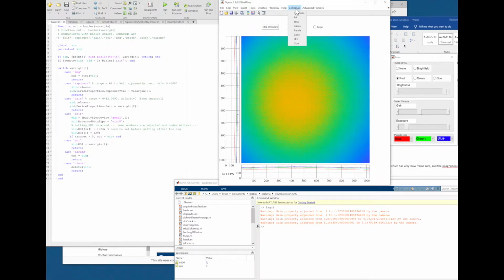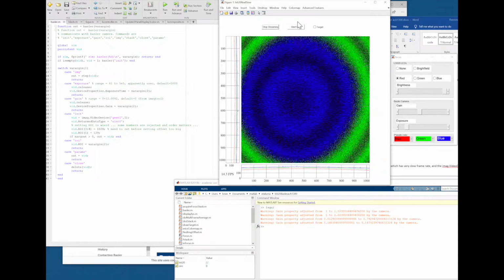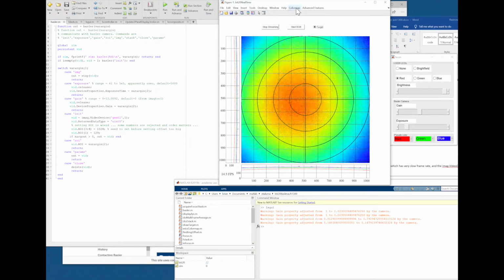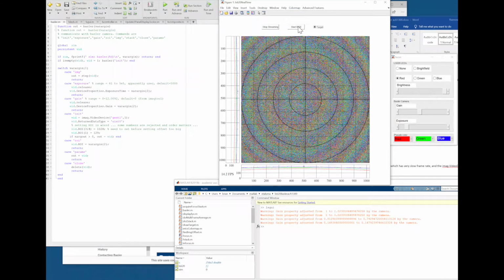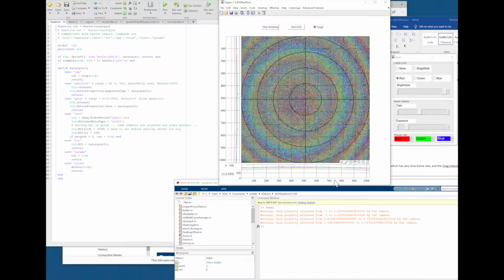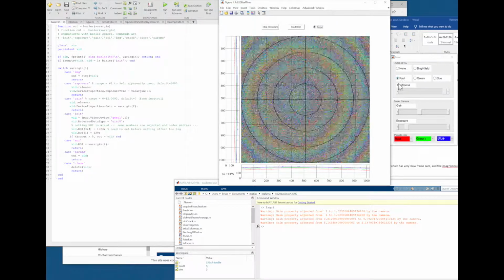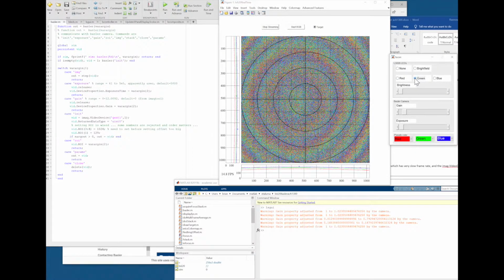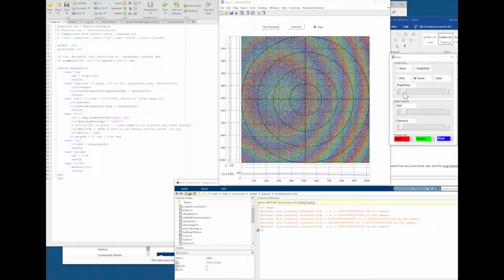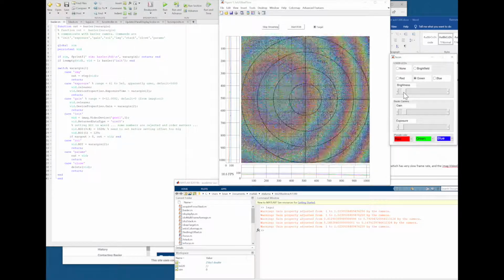Now we can change the color map. I made this color map for Eric. Oh, and again, let's put the target on. A little easier to see in a jet color map, or if we replicate the jet, I called that Brian's. We can see here the alignment. And let's switch to green. Green is quite differently aligned.